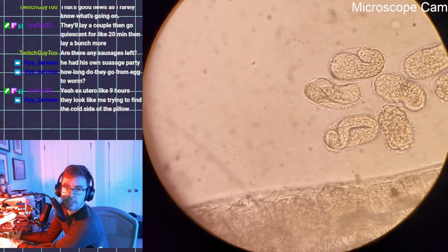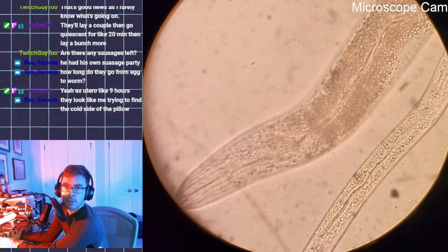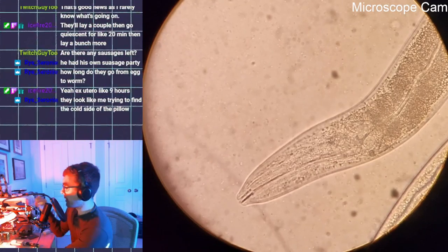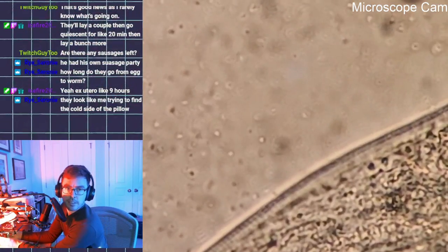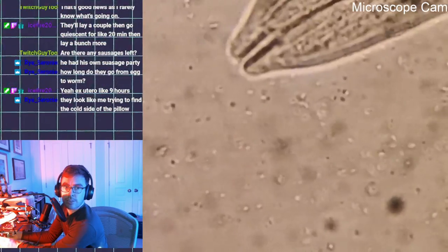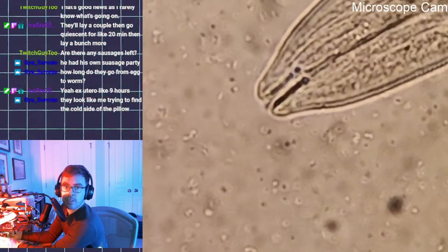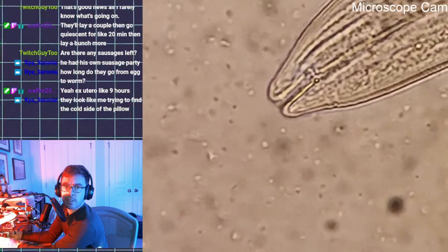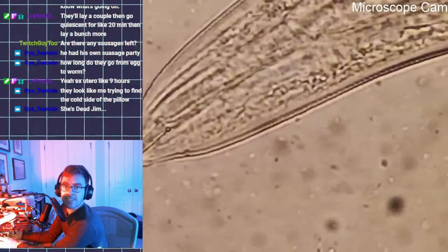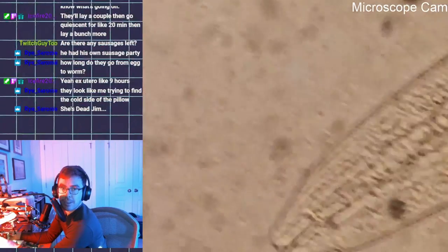Oh, and there's a big worm next to them. A big unmoving worm. So she must have gotten a good dose of the levamisole. Actually, she's very... Come on. No. So that's the mouth. She's dead, Jim. Ooh, that's a good... I should find that for a chat command.